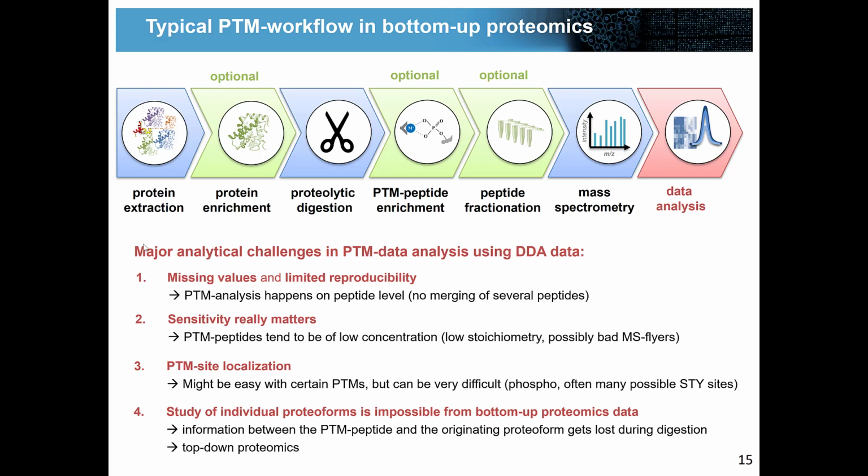Yes, and then a last challenge that we have in PTM analysis is the challenge of studying different proteoforms. As long as we apply this bottom-up workflow that I showed you up here, where we digest our proteins into peptides, we completely lose the information of how PTMs occurring on different peptides are talking to each other.